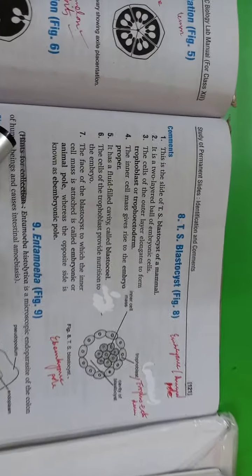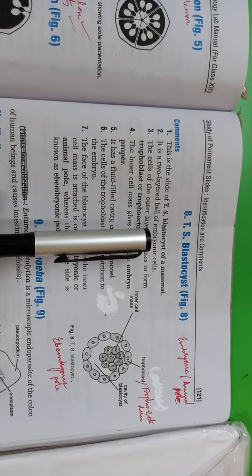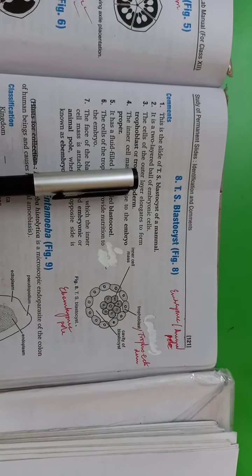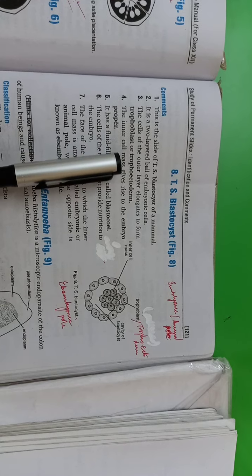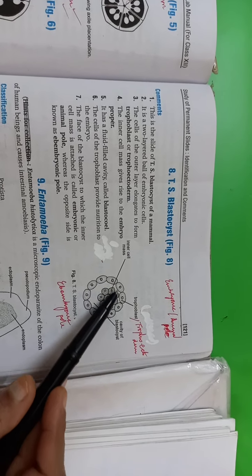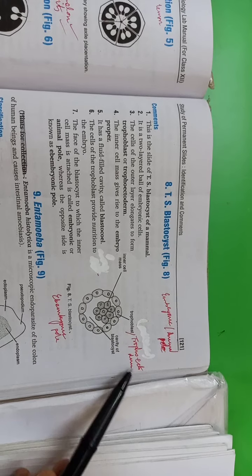So let us see how to go. The first point is, this is the slide of TS of blastocyst of a mammal. It is a two-layered ball of embryonic cells. The cells of the outer layer elongate to form trophoblast or the trophoectoderm. So these cells, the outermost boundary of cells, is called trophoblast or trophoectoderm.